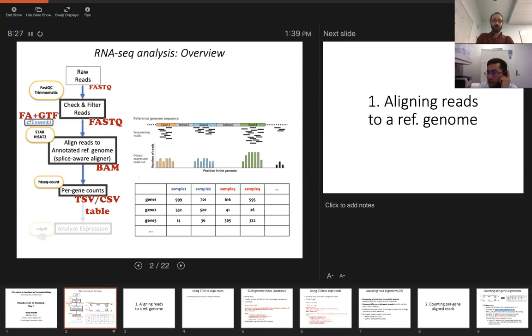Okay, so is this clear? Any questions up to here?